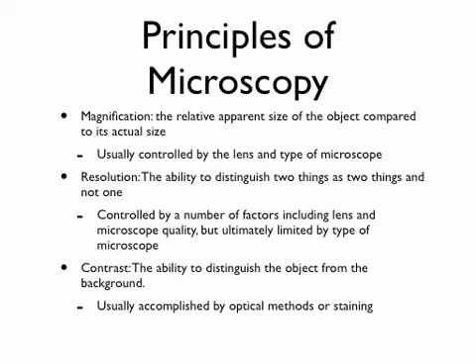So, yeah, they're actually, there's a little bit of stuff in there, so they're going to be a very light gray. So often you're looking at a cell that's very light gray on a white background. How much contrast is there? Not very much. So you're going to want to do something to increase the contrast.